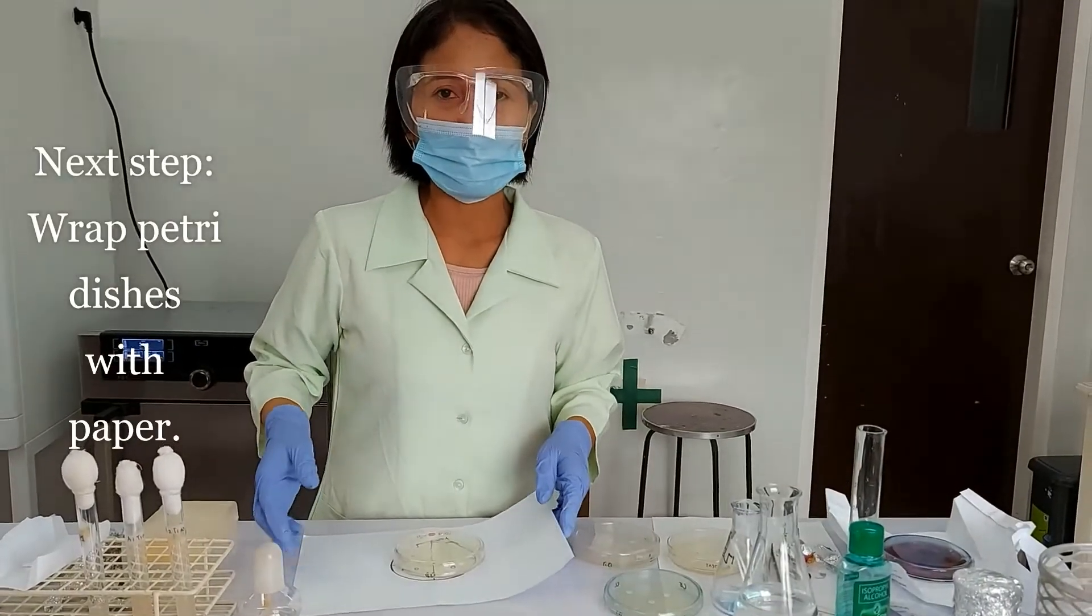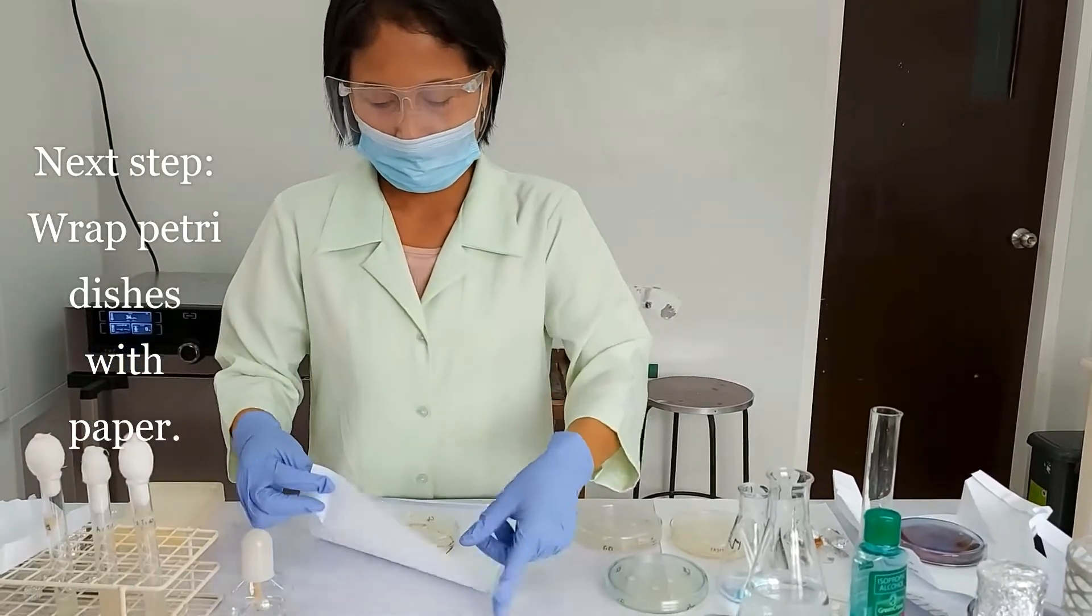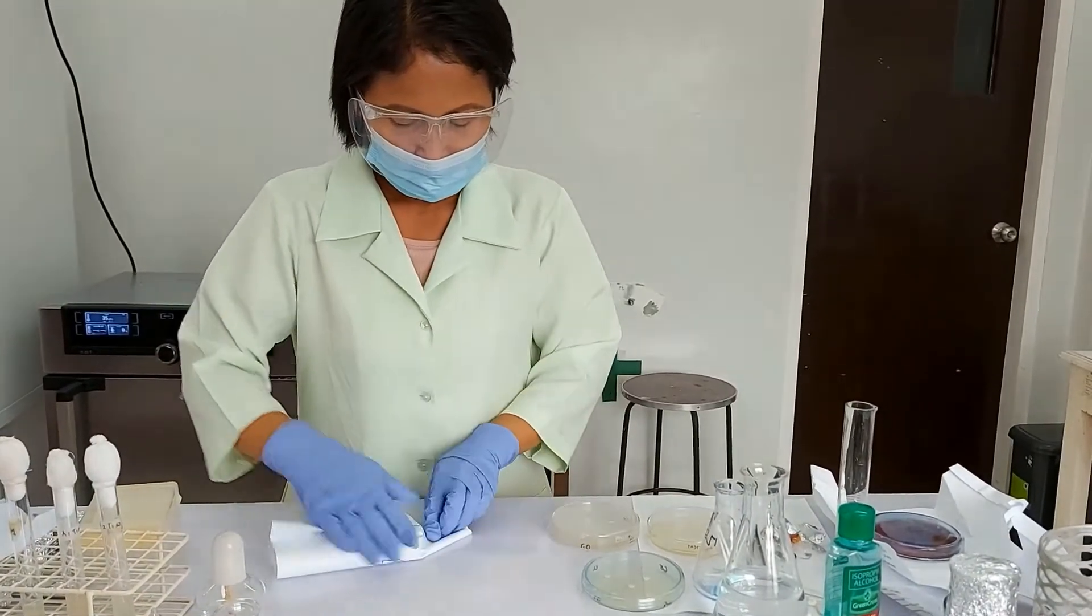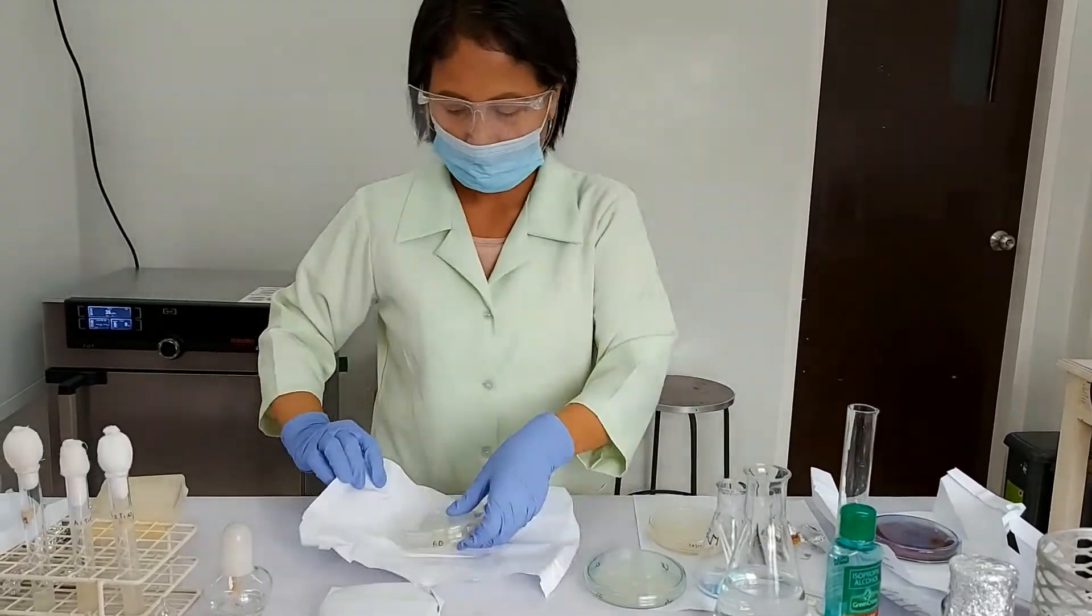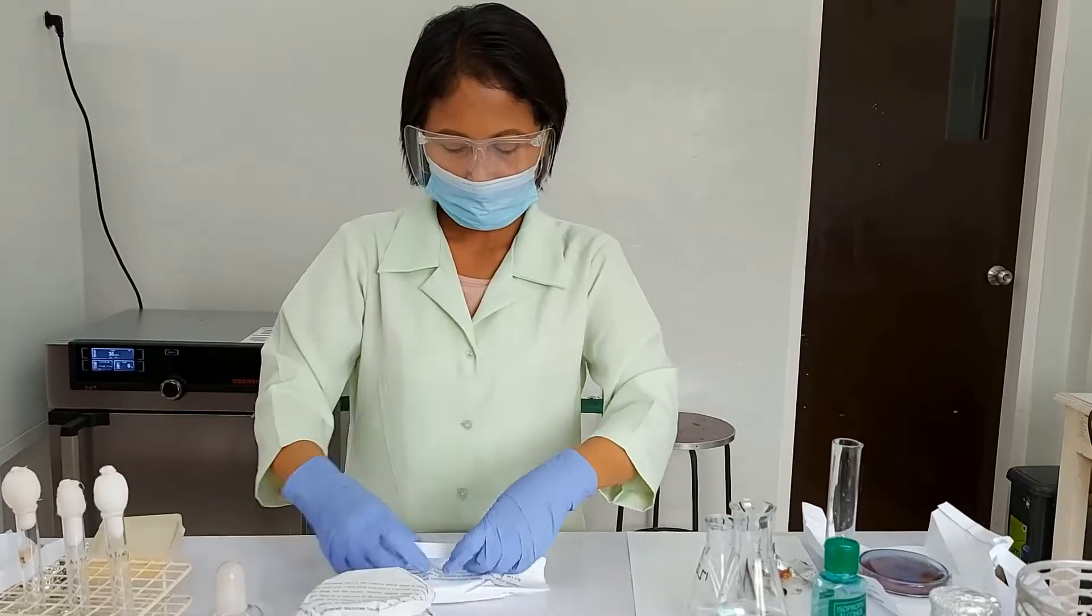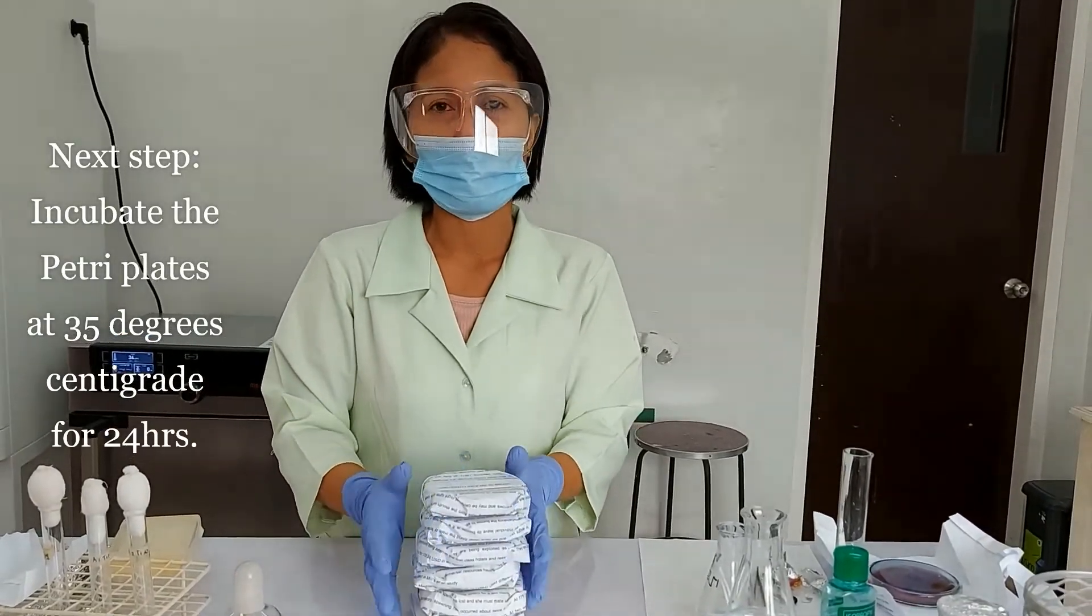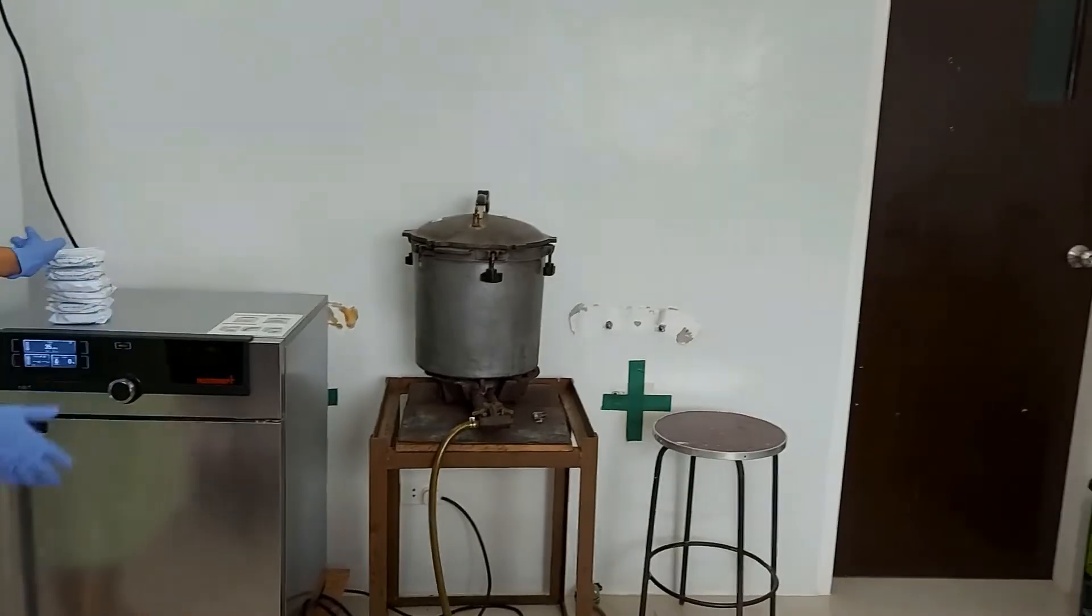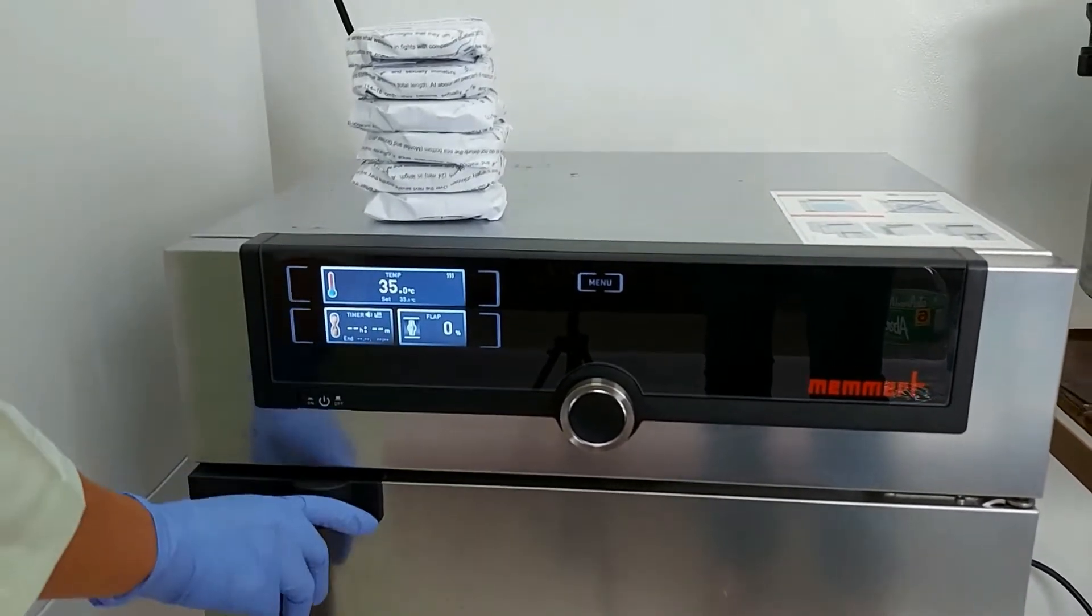The next thing that we are going to do is to wrap our petri dishes, wrap it with paper so we can incubate. Next is we are going to incubate this for 24 hours at 35 degrees centigrade. Our incubator is set at 35 degrees centigrade.